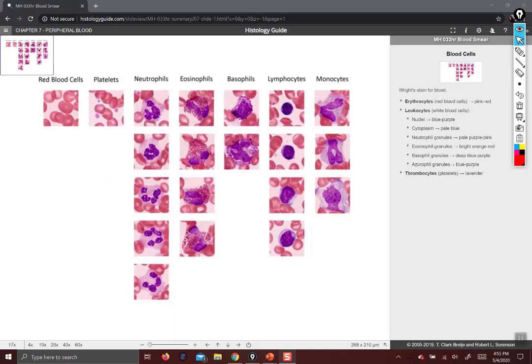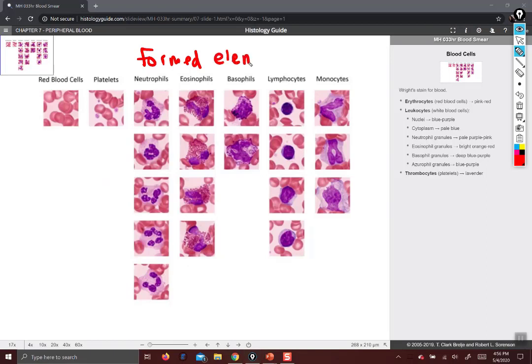So I've started on this particular slide on Histology Guide, and this one isn't really a slide — it's just pretty much a diagram. This is showing you the characteristics of the different formed elements of blood. These are the parts of blood that are cells and not plasma.